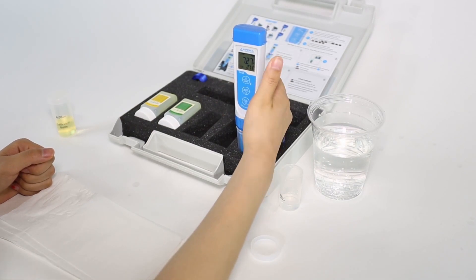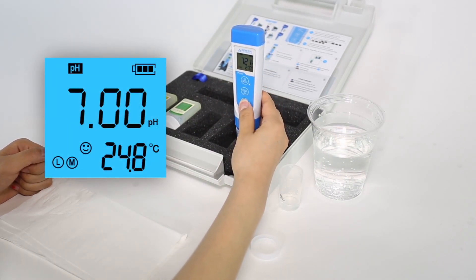If the reading is very close to 7.00, for example 7.05, that means the probe is very accurate and calibration is not necessary. If the reading is not close to 7.00, for example it is 7.2, you will know it is time to calibrate the probe.